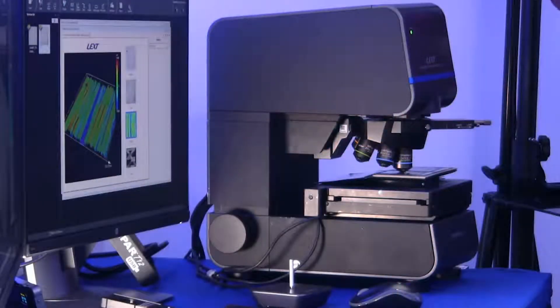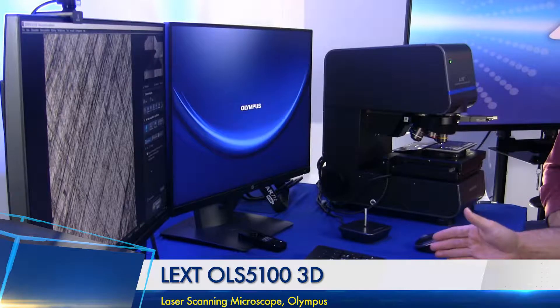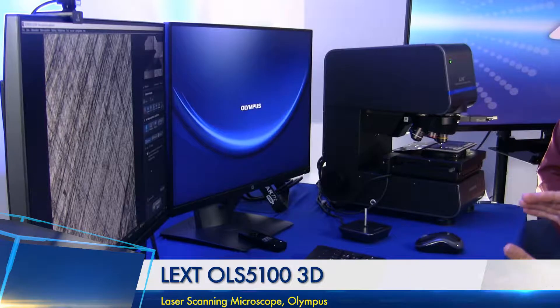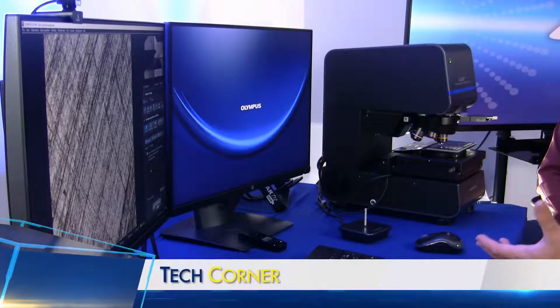Today we have the LEXT OLS 5100. This is our next version up from the 5000 — it was really a software improvement, and we're going to cover a couple of the major software features that were added to the 5100. The LEXT is our laser scanning confocal microscope. This system is capable of very high magnification, high resolution imaging — magnifications over 17,000 times.